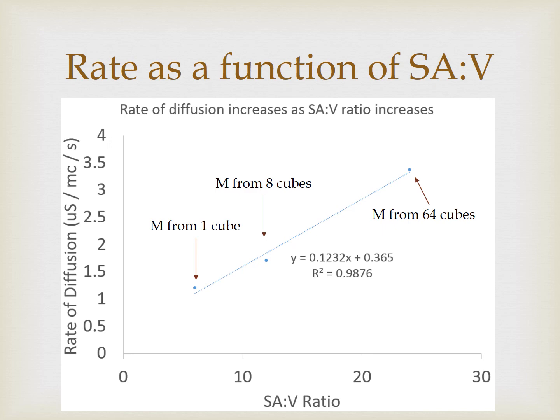And those two sets of graphs together, maybe you could combine the original traces from Logger Pro into a single graph, and then the second graph tell the story. How did I collect my data, and what does it mean? You'll also be doing something very similar for the new variable that you and your group tested that was different than the other groups. So I think you've got enough information now and enough understanding that you'll be able to answer and put together your lab report with a lot of care and telling a good story.